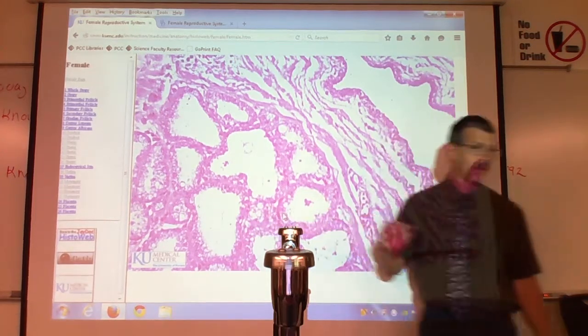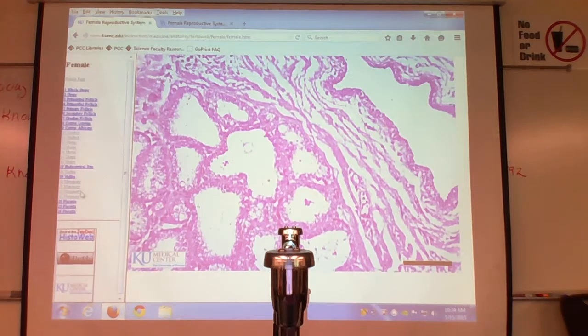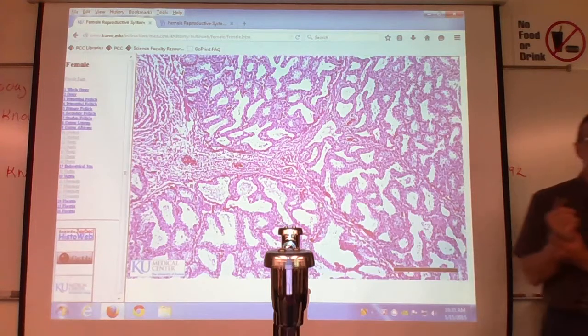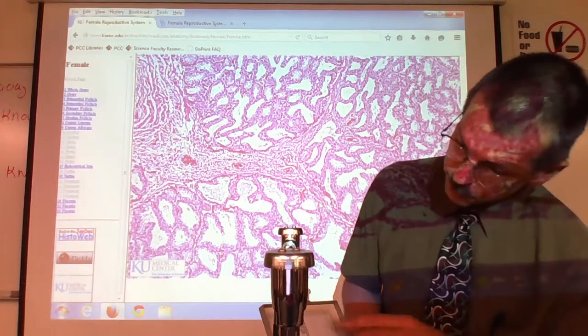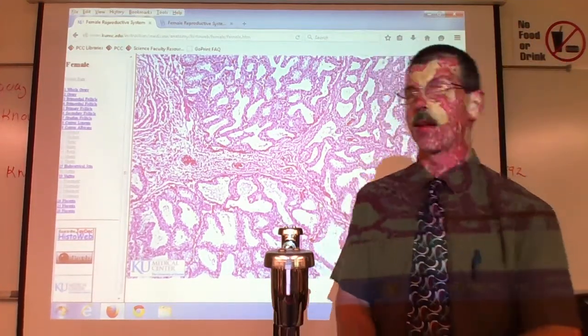Can you show us an inactive one? I can. So they're just different in size. Here's more resting. So you did lactate, now you're done. Now they're back to kind of normal, smaller sizes. There's more of them. Do we have lactating and non-lactating slides here? I do not know. I never looked. Let me look. Yeah, we do. You have an inactive and an active mammary gland slide.